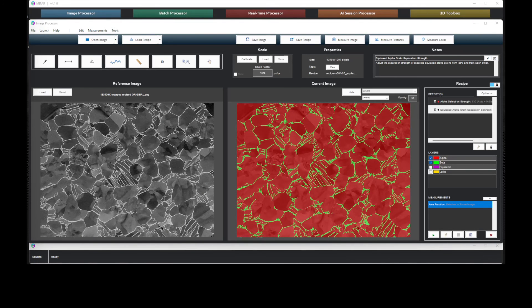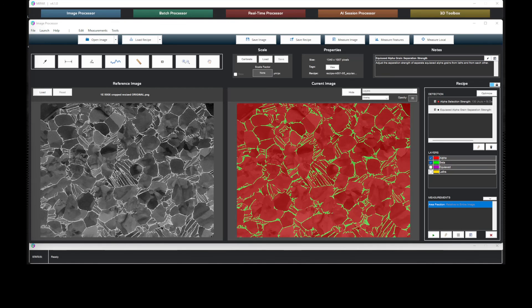The capabilities of detection, measurement, and report generation are also available when processing batches of images.